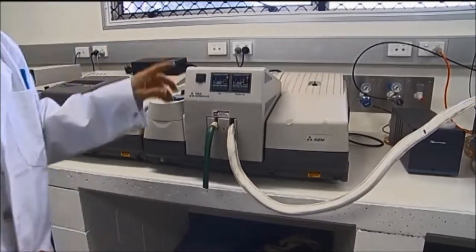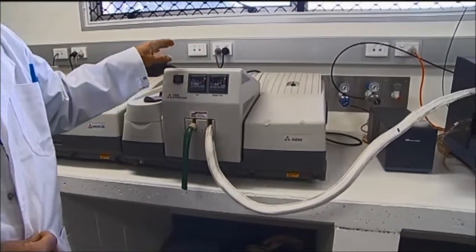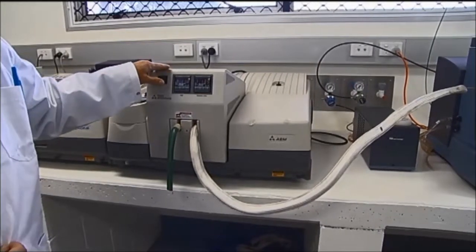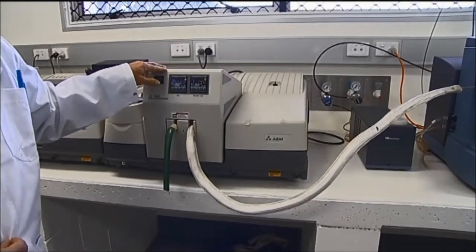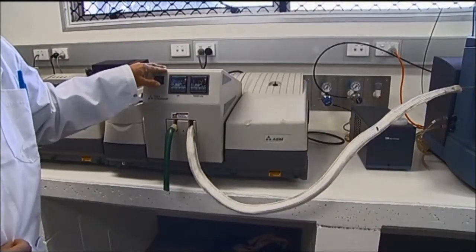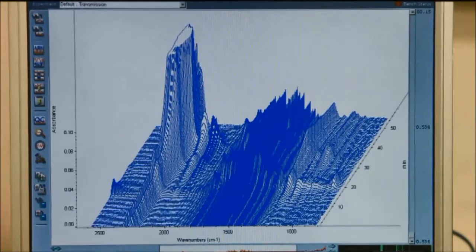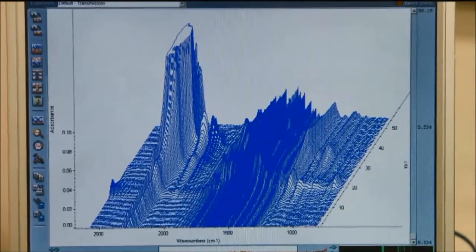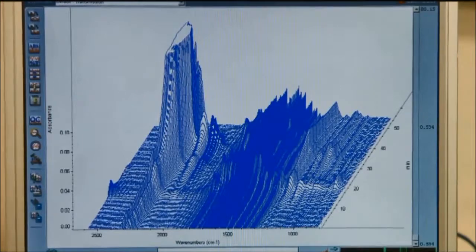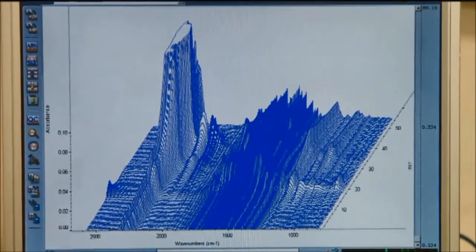Simultaneously with the TGA thermogram, we are able to collect every 10 or 15 seconds the infrared signals of the emitted gases. This graph shows a three-dimensional view of the infrared signal of the gases emitted during combustion at different times.